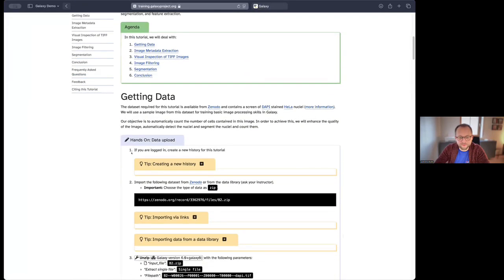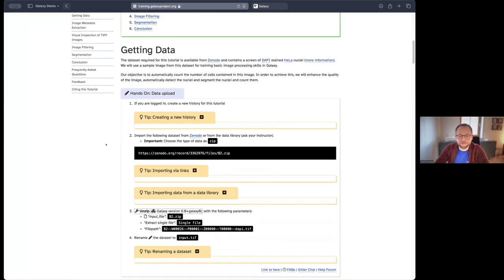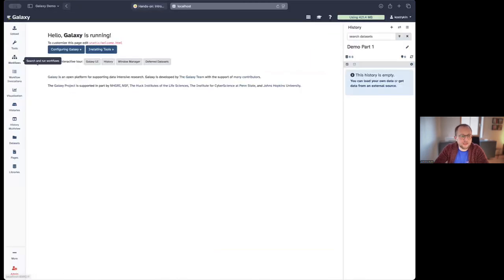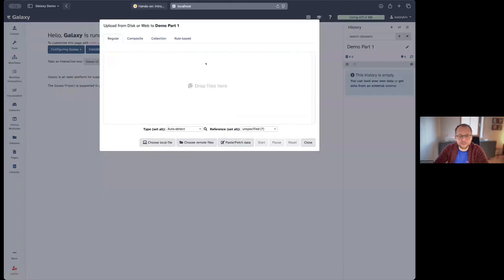That said, the first step of the procedure will be to acquire the data that I want to work with. To do so, I pick the URL from the tutorial, which is linked to a zip archive hosted on Zenodo. To load this into Galaxy, I will use the upload button.